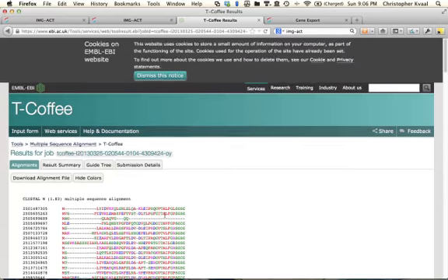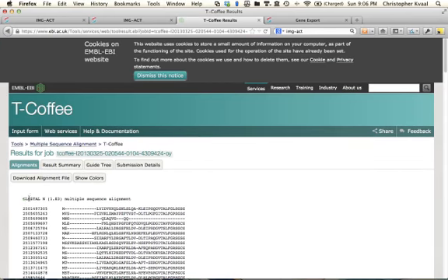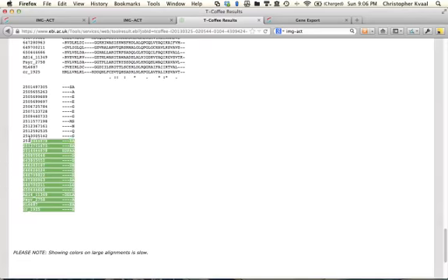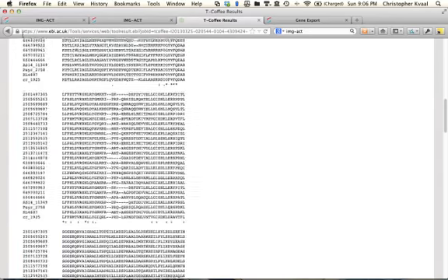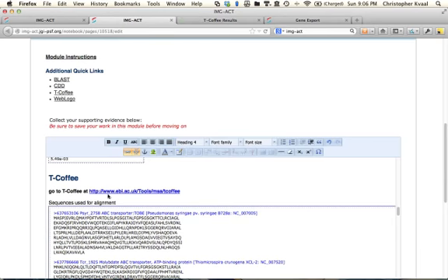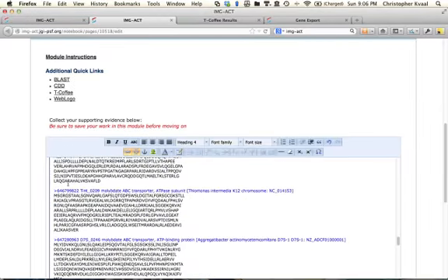Okay, well, the colors look really cool and they're fun, but we don't need those colors in our lab notebook. I'm just going to scroll to the bottom of this guy. Pop right up to the top. And I hope you can see the purpose of my renaming them. So those files that I renamed are down here. You see, otherwise you just get this number. But again, in the interest of time and keeping this tutorial short, I'm not going to manually change those numbers.